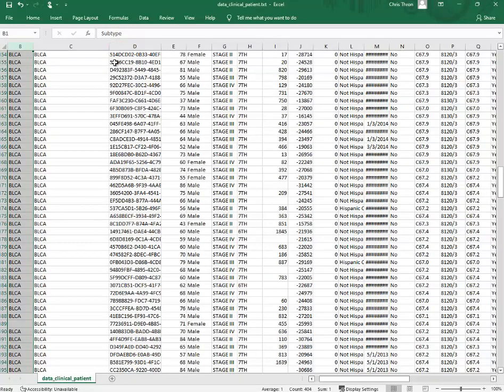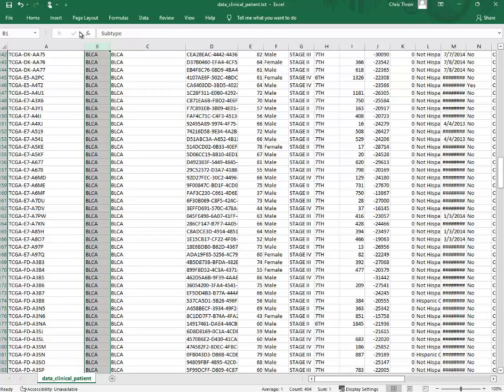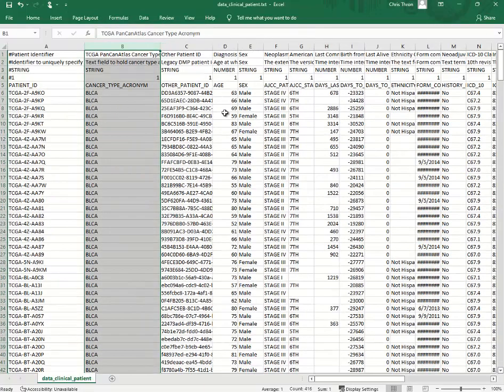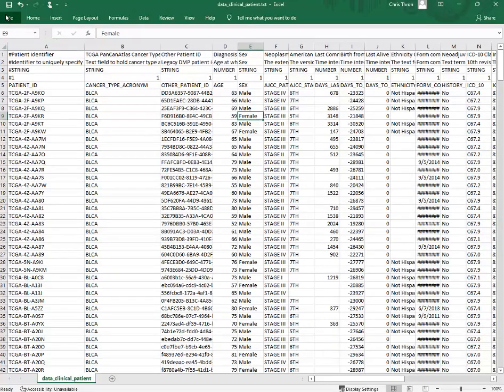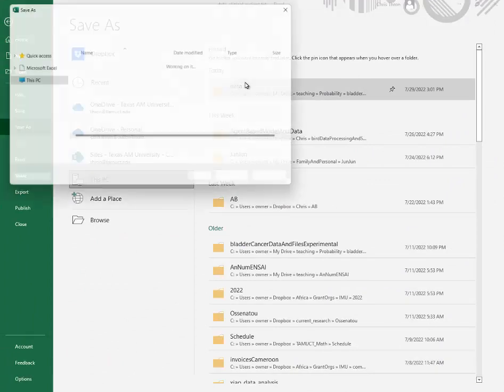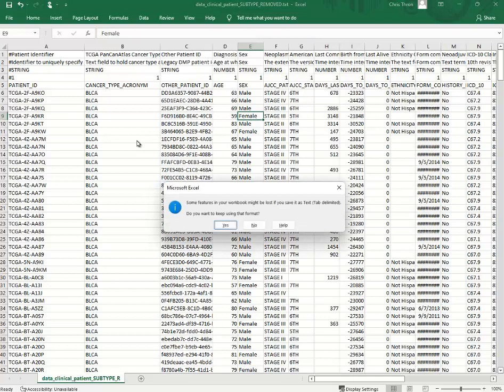Yeah. I'll just have to rename the file. And then, so I'll just remove this one here. And then I'll just say, and here I'll just say, so then that makes it clear.